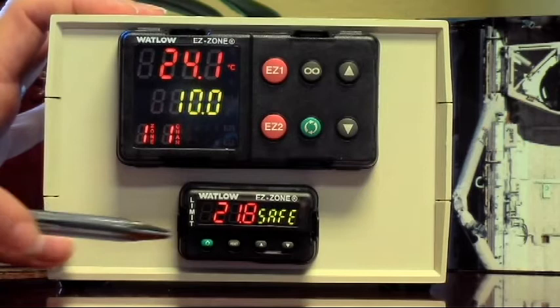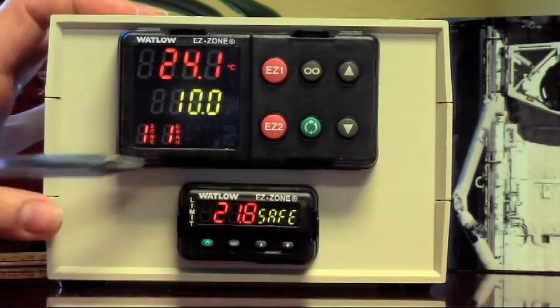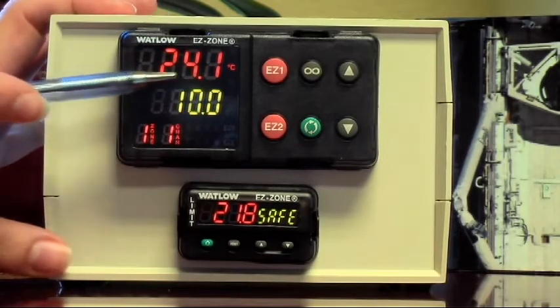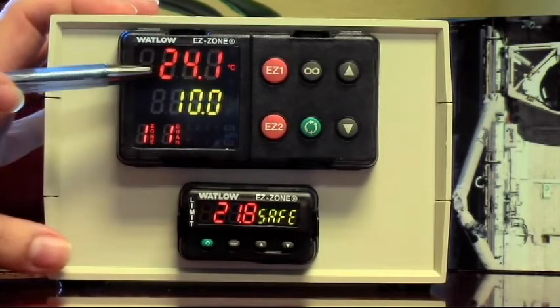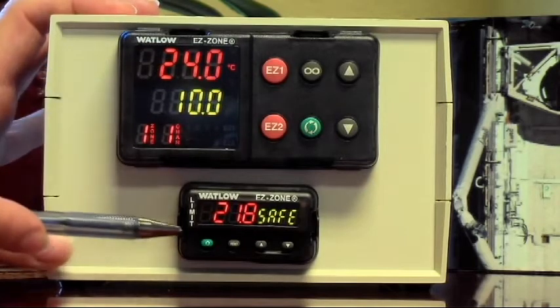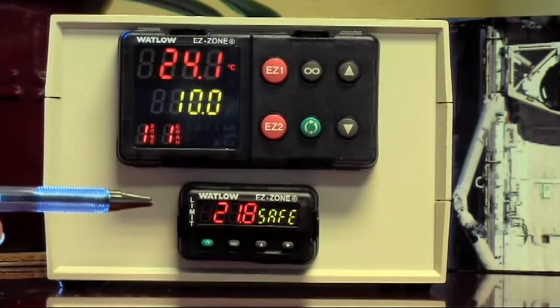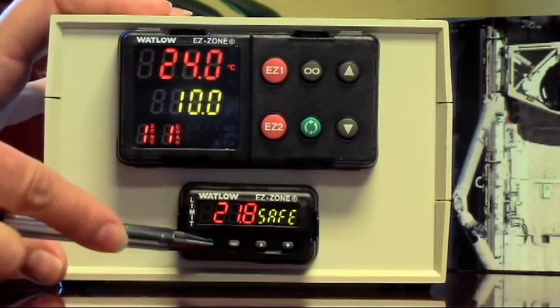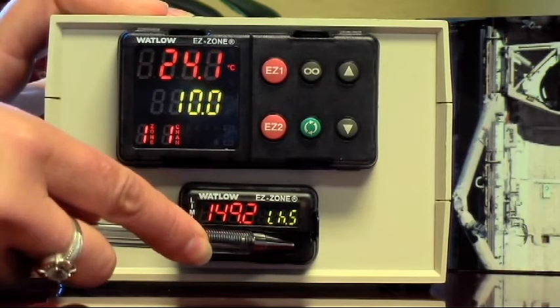This tells you that it's safe. This is how the display should look all of the time. Let's say for fun that it's not safe — that you're experiencing an alarm condition. The high limit is reading from the main controller, and right now the main controller is seeing a temperature of about 24 degrees. I'm going to set the alarm threshold to 20 degrees, so anything over 20 will be an alarm condition.